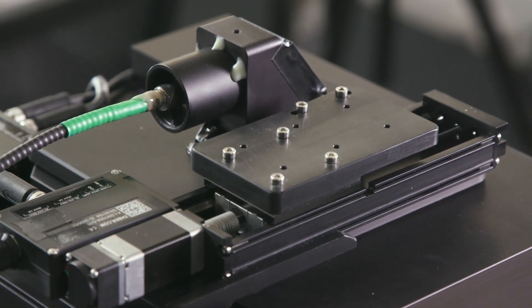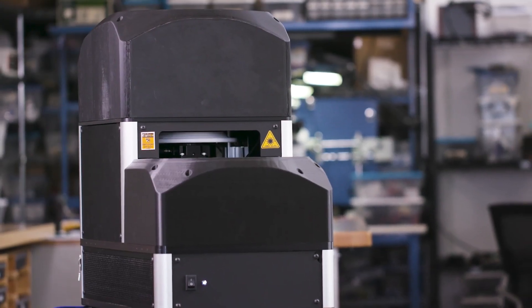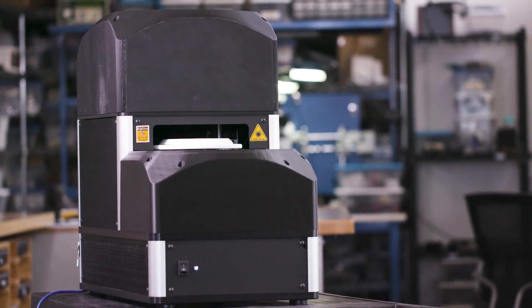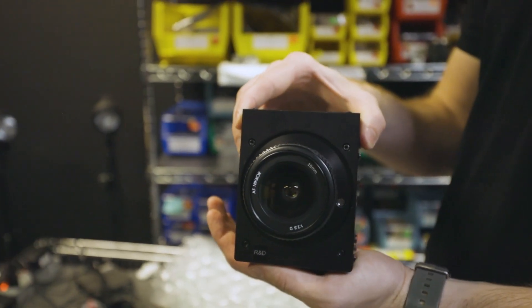We can take a spectrometer that Ocean makes and solve real world problems with it, which I think is a lot of what Ocean Insight is about. It's not just producing spectra but producing real answers that you can take action on. I think there's still a lot of areas that could benefit from this that just no one's thought of applying it yet.